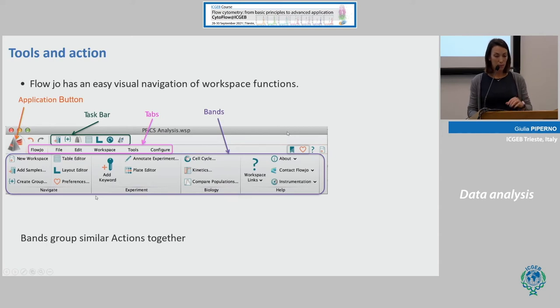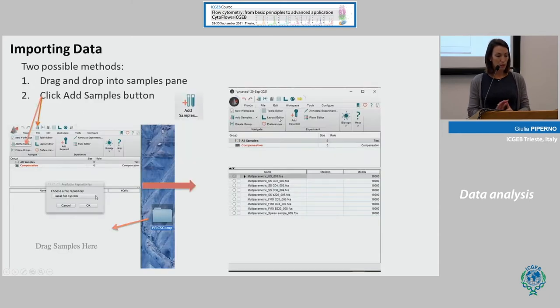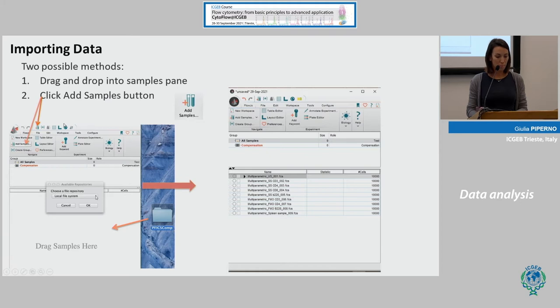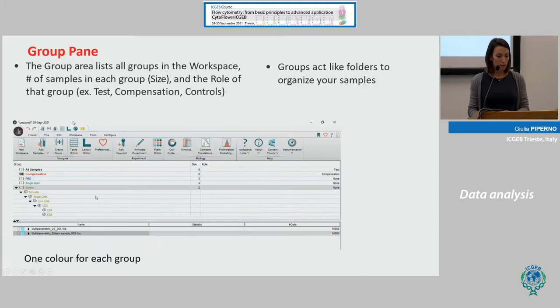Starting to import your data acquired at the flow cytometry machine: there are two different possibilities. You can drag and drop directly the samples into the sample pane, or click the Add Sample button, which is located in two different positions.